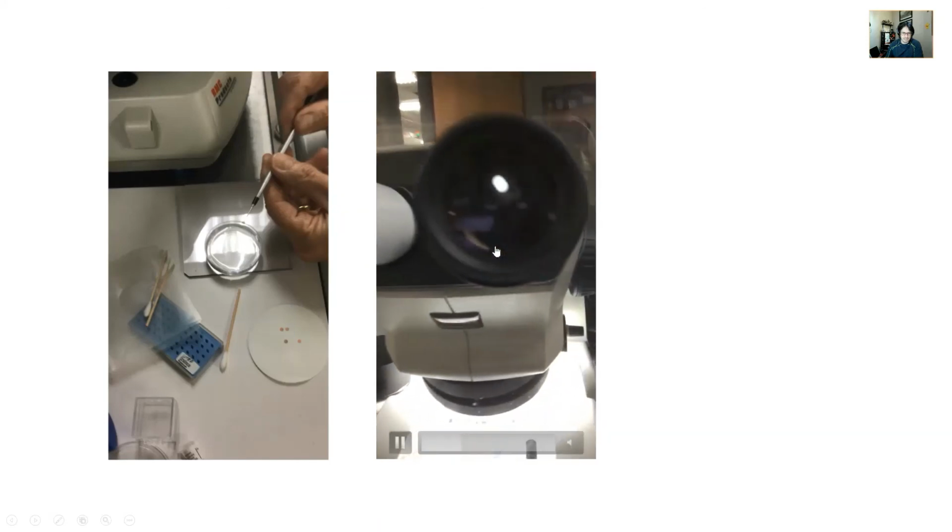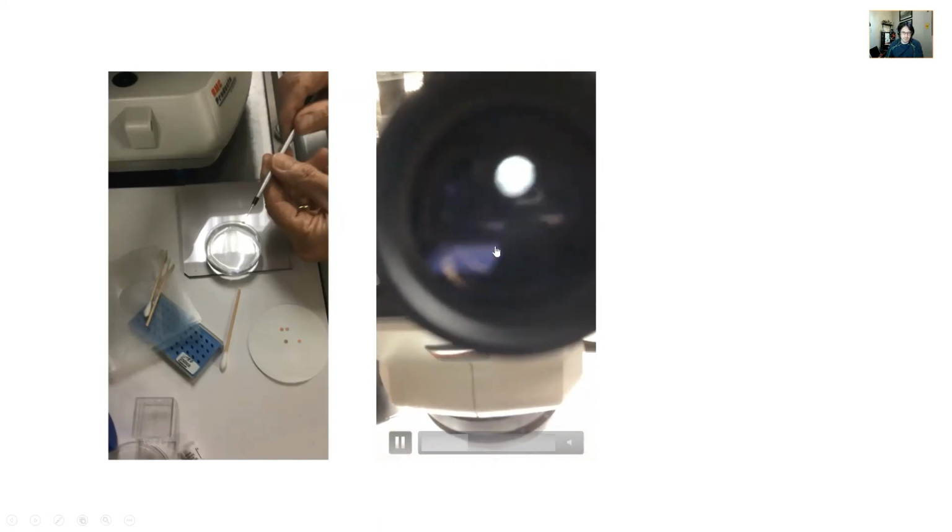And I kind of tried to take this image when he was here, and we get these little shavings, and so this is through a microscope, and you can kind of see it. I have another video somewhere else, and I posted it one time on like Instagram or something of making this. But you get these little polymer shavings.